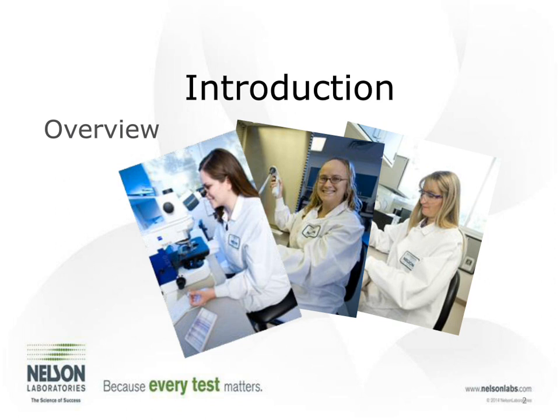So with that, we're going to be doing an overview of the three tests. What do those three tests look for? How do we look for those endpoints now with the testing, and then talk about some tests that are evolving, that are gaining some acceptance worldwide, that we're trying to implement for medical device testing going forward.